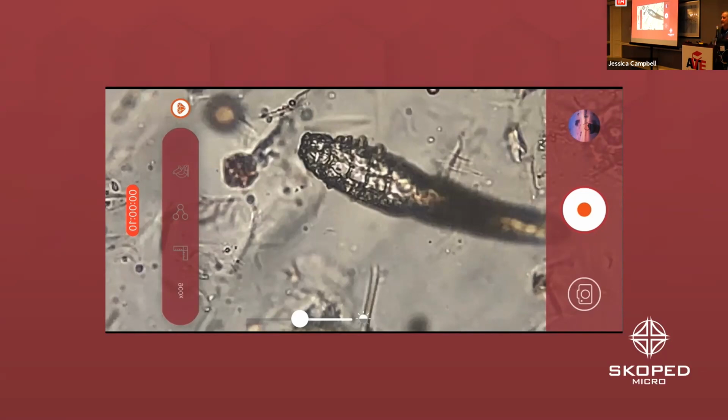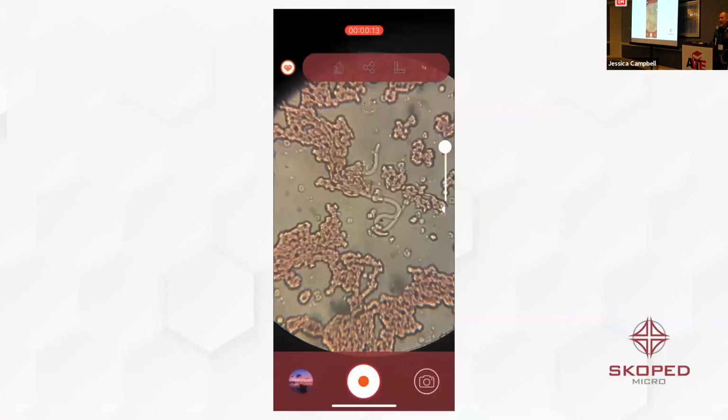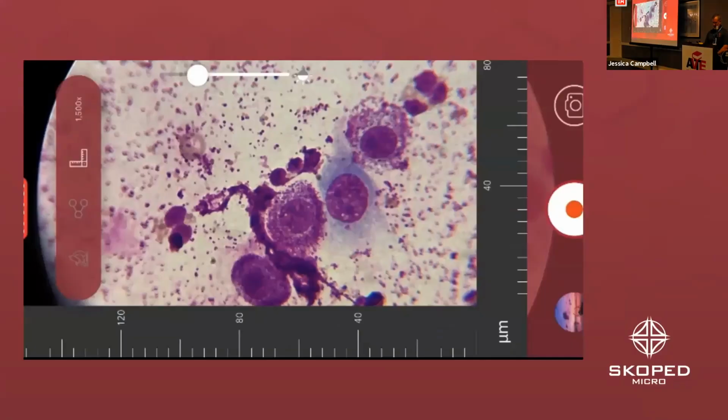Okay, a couple of pictures. What is that? That's an easy one. This is a lot better on video, and one thing I didn't want to do on here is put a video and bog it down, but on our social media you'll see all kinds of stuff. So, heartworm, microfilaria. I've got a lot of those pictures. They're going to get harder.